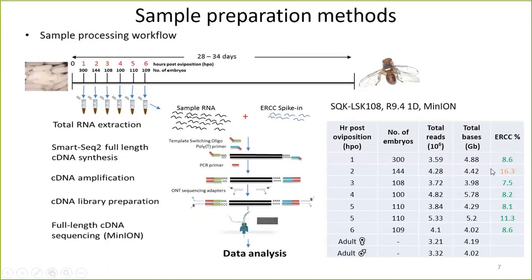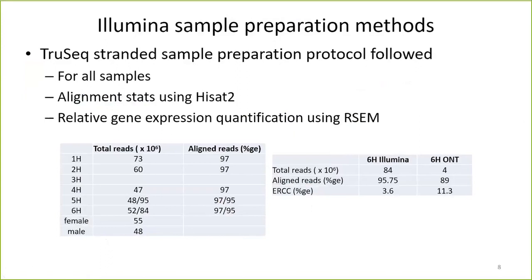So we also performed Illumina sequencing for these embryos, so we performed the Illumina TruSeq stranded sample preparation protocol. That's the one that we used. When we did this for all the samples, all the reads, we aligned them using HISAT2. And then for the relative quantifications, we used RSEM.